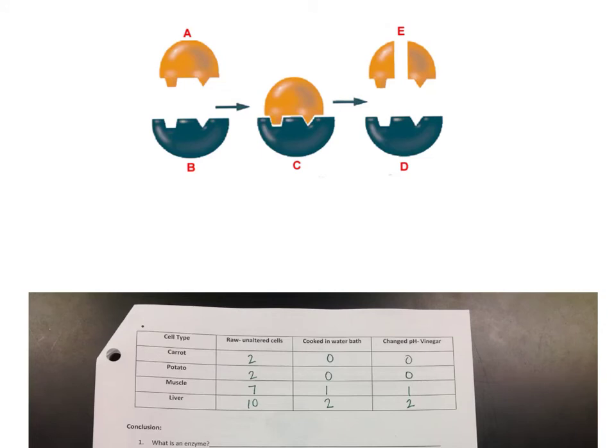Now that you've completed your experiment, you should have collected some data that can allow you to make some interpretations about what's going on in this activity. Hopefully what you saw was lots of bubbles in the muscle and liver cells in the raw and unaltered foods. There were a few in the carrot and potatoes, the starches and the plants. And then once you put these foods into either a cooked water bath where you would have heated them up, or changed their pH by putting them in vinegar, there was a drastic change in the amount of bubbles that occurred when you added the hydrogen peroxide.